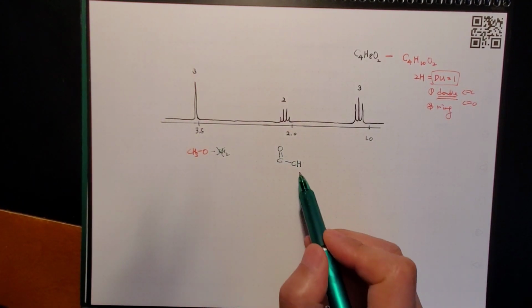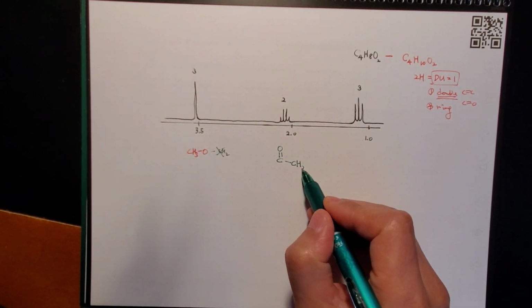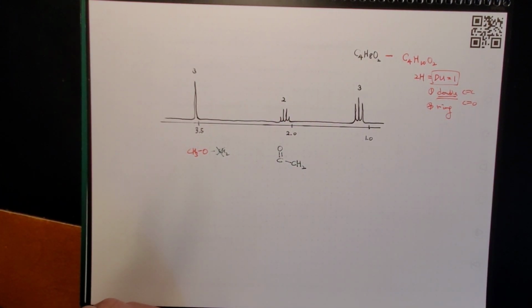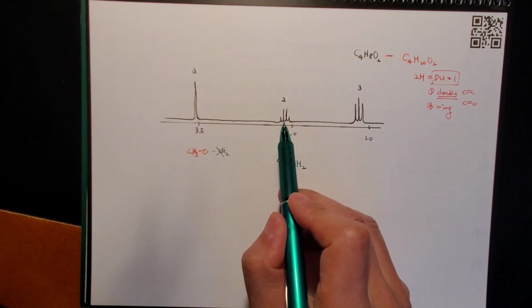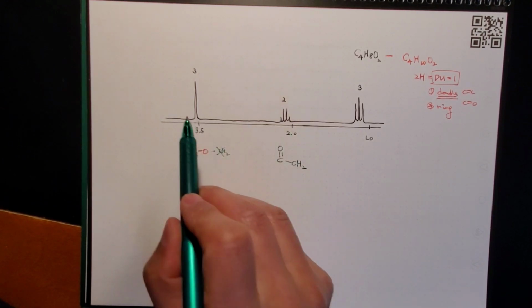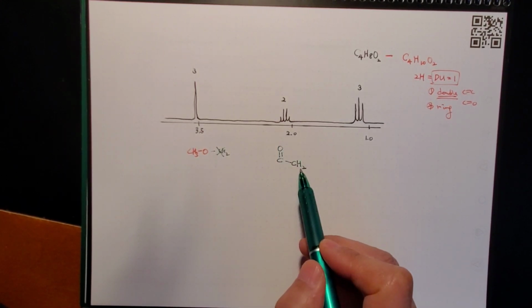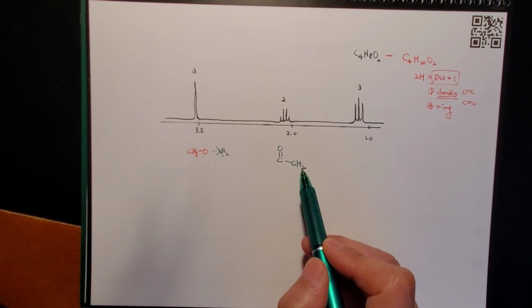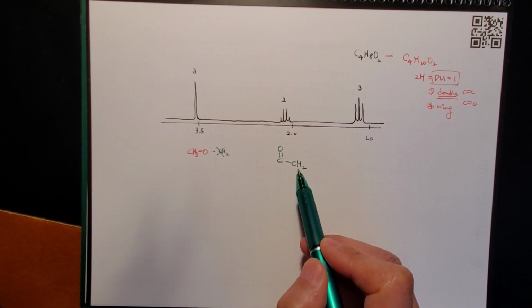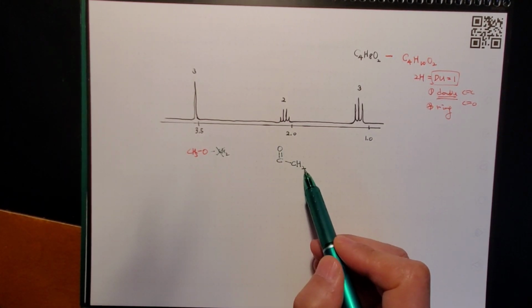There it is. And how many hydrogens do you have? The integration tells you there are 2 of them. Okay? Then what does it say? There are 4 pieces of information on the NMR. You saw 3 different hydrogens, so type of hydrogen. And you saw chemical shift. So we got this information, being beta to the oxygen double bond. Then 3 integrations. So we applied it.